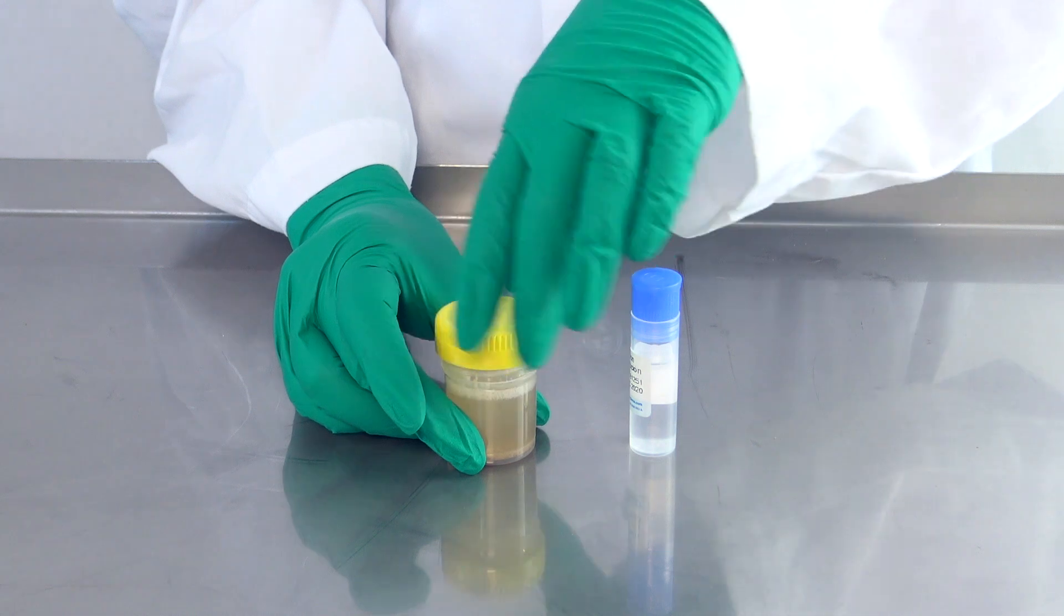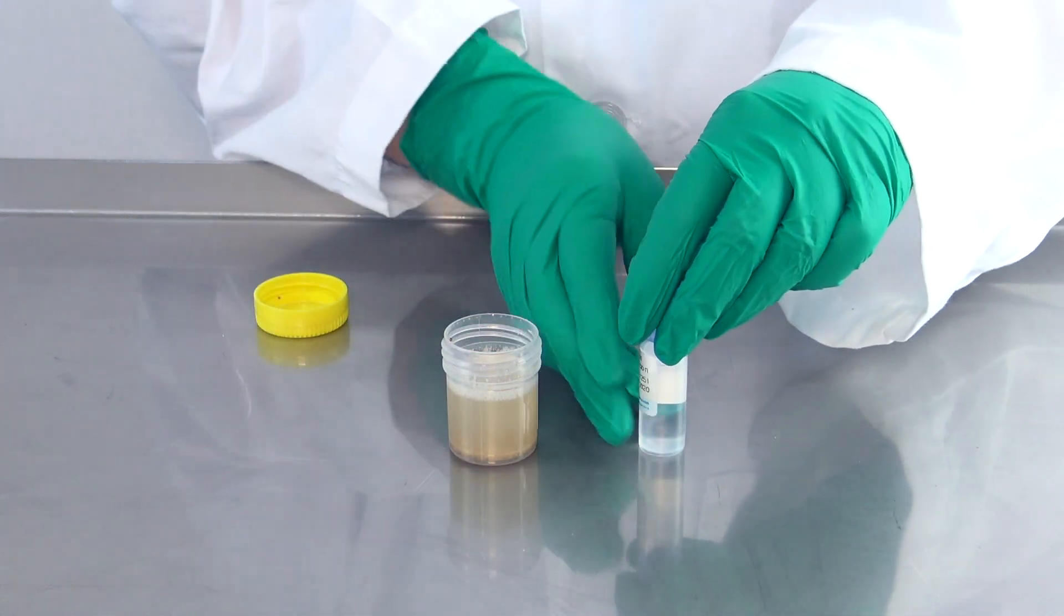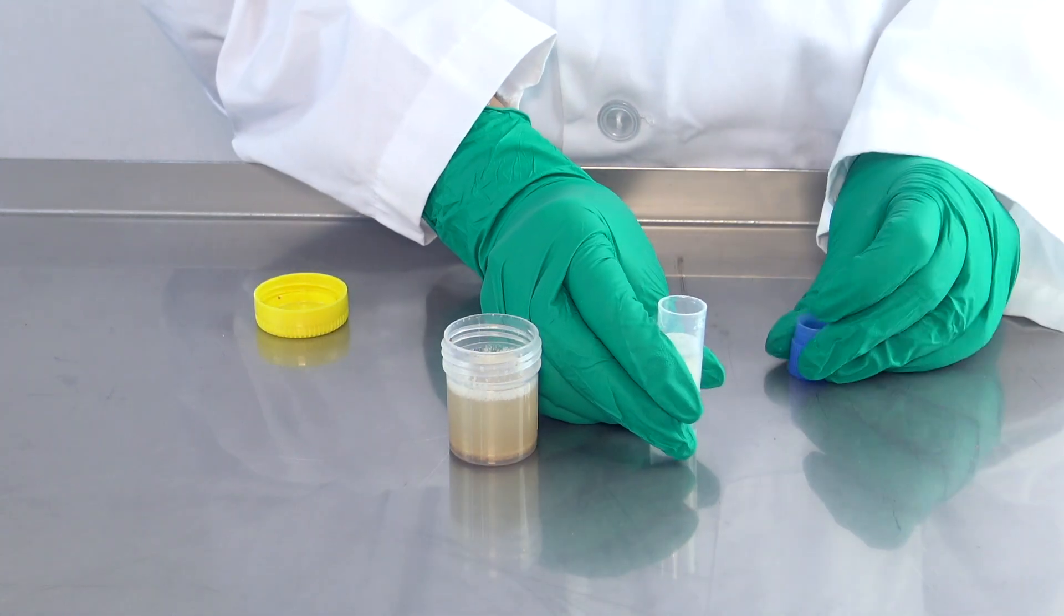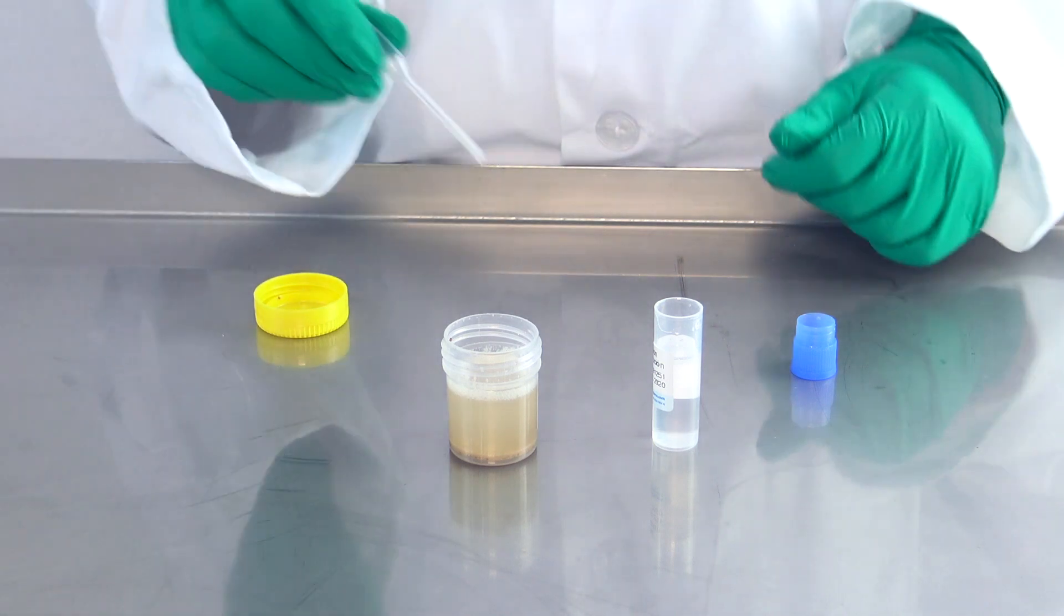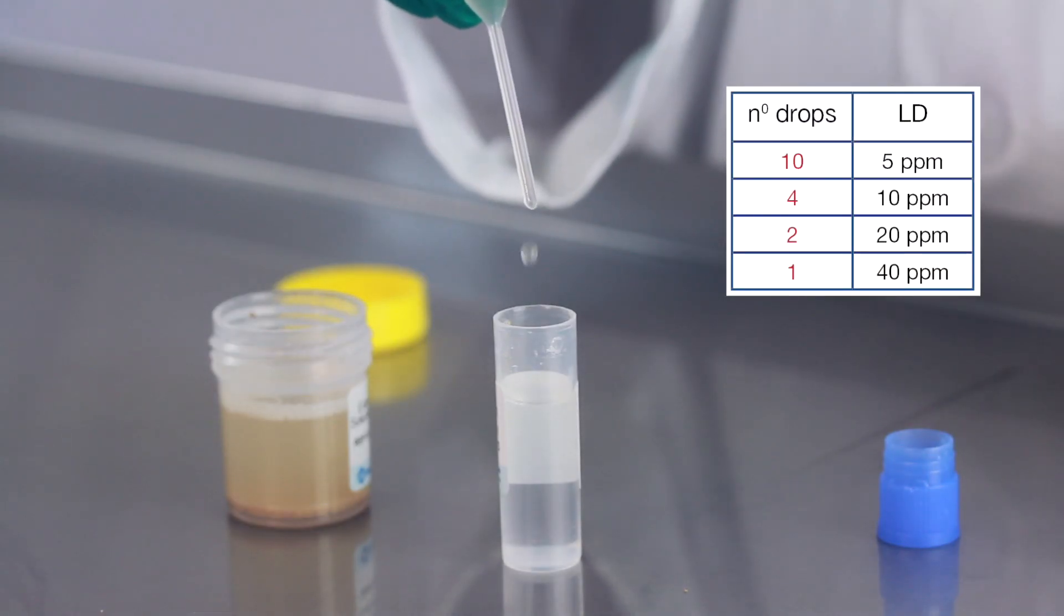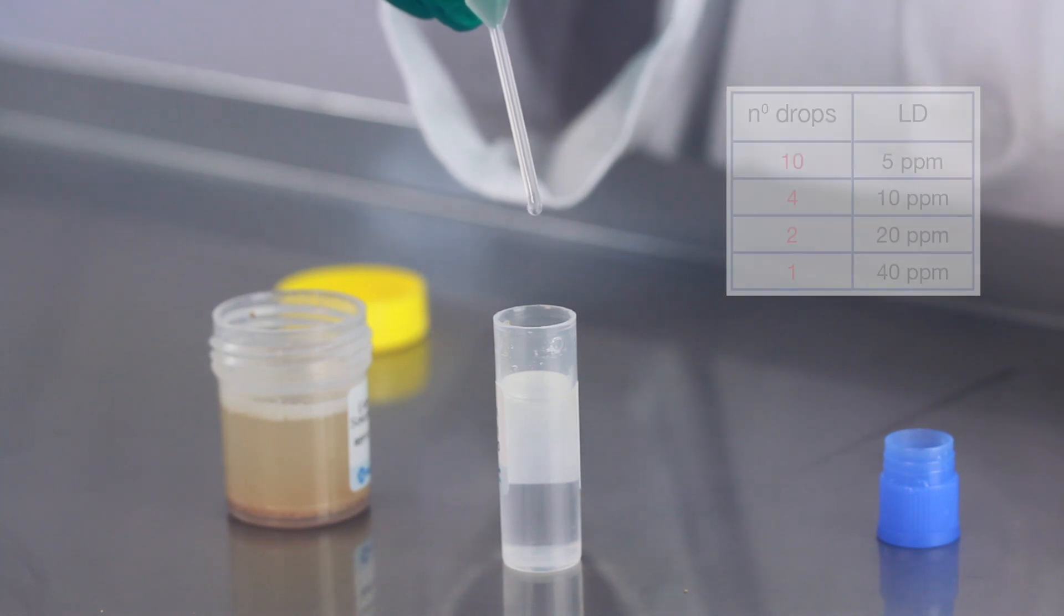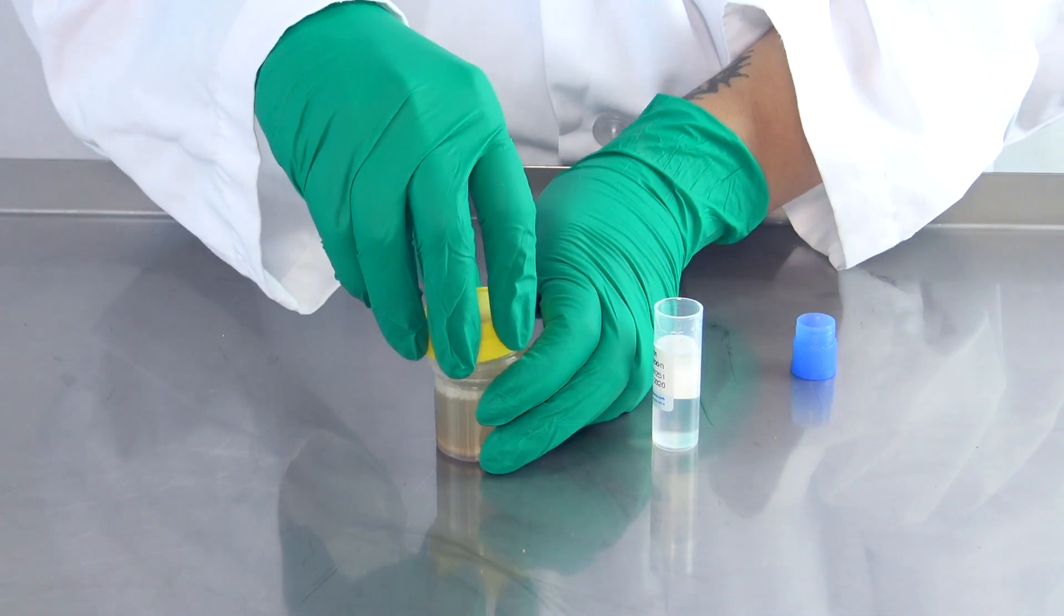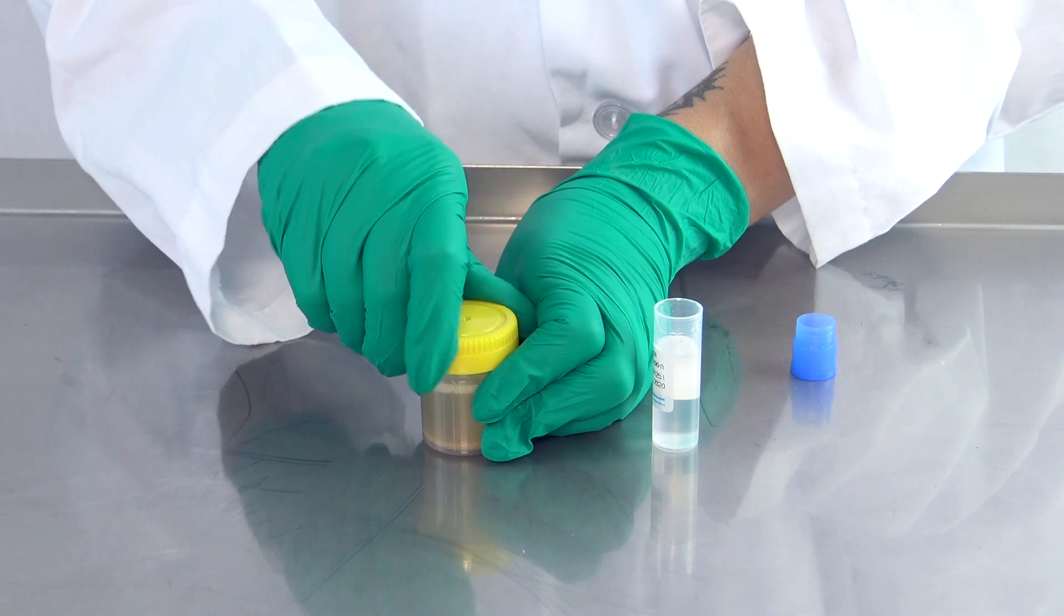Open the extraction bottle with the yellow cap and one dilution vial with the blue cap. Take a disposable plastic pipette and using the number of drops indicated on the manual, transfer the liquid from the extraction solution with the yellow cap to the dilution vial with the blue cap. Dispose of the used pipette.